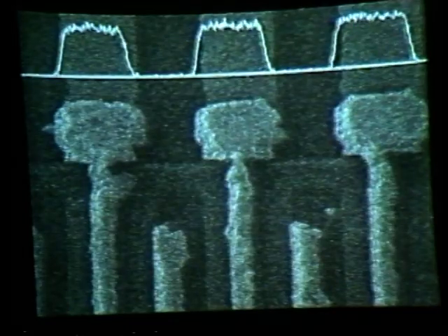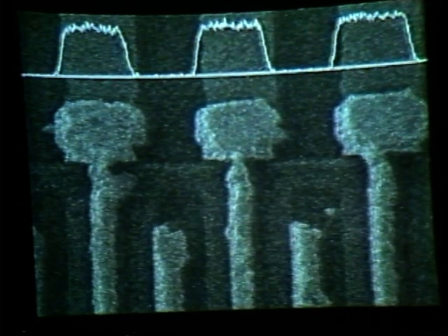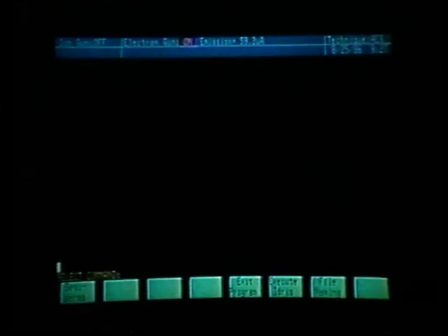We can then obtain an image of this, obtain a photograph by entering the photo setup mode. To do that, going back to the terminal, let's exit the line display menu using soft key number 8. Enter the photo setup using shift, pressing function key number 20.